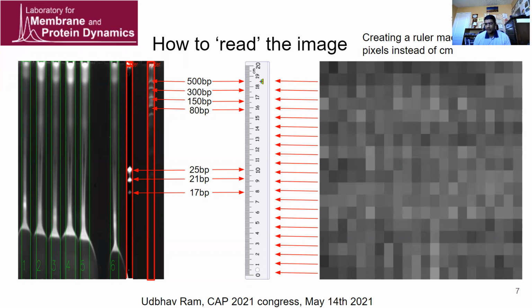With computers, it's not as easy because we don't have a ubiquitous tool such as a ruler, which stays constant over all types of images, pixel densities, aspect ratios, and device parameters. So what we do is use pixels. And these pixels stay standard across all images and provide us with a standardized unit of measurement, which we can then correlate to our real-life values, in this case base pairs, on our image and on our ladder more specifically.